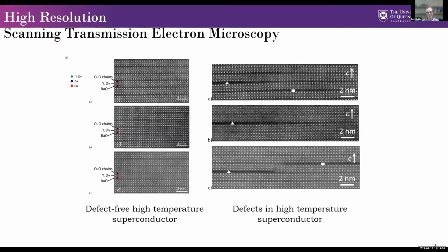The thing that is always bad is when you follow people that can do all this high resolution work. So I would just show you a high resolution TEM image and say that that's the last time you're going to see this now. We see some lattice fringes at some point, but really once we go into liquid, we lose huge amounts of our resolution.